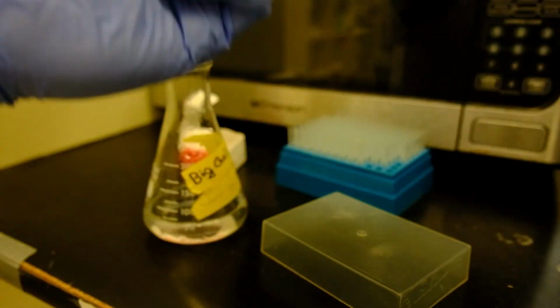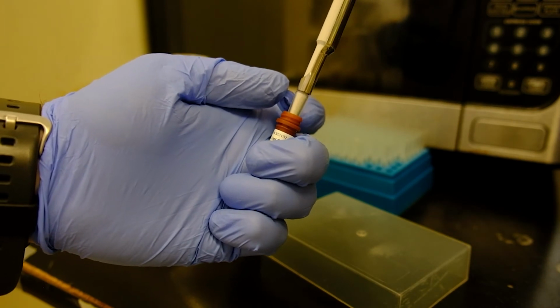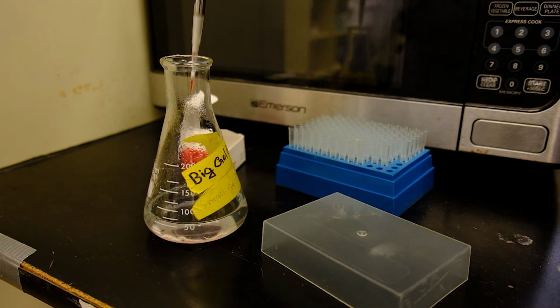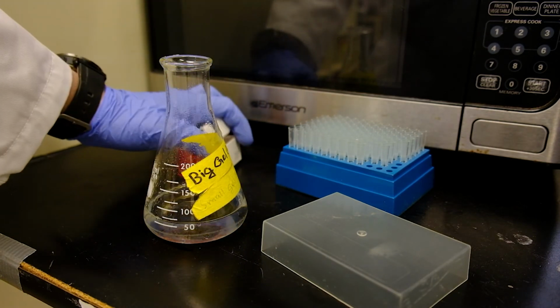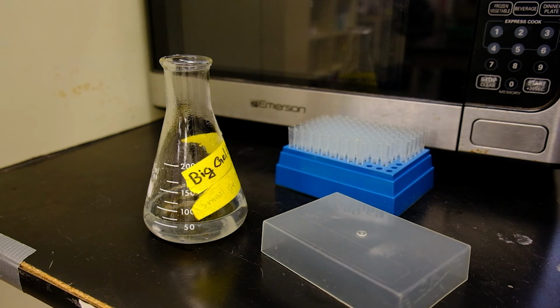Set your pipette to the correct volume. This particular dye is 10,000x, so we only need 7 microliters for 70 milliliters of the TAE buffer. Add it to your solution. Put the dye back in the box, and dispose of the tip in the green bin since it's now contaminated with a carcinogen.